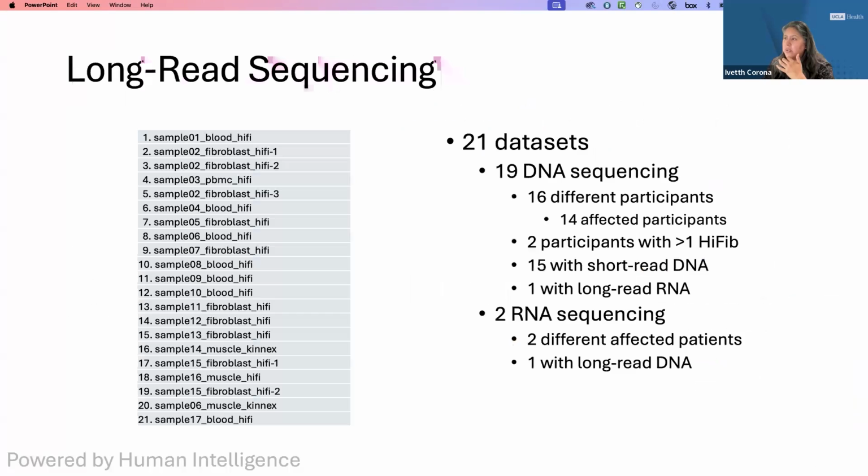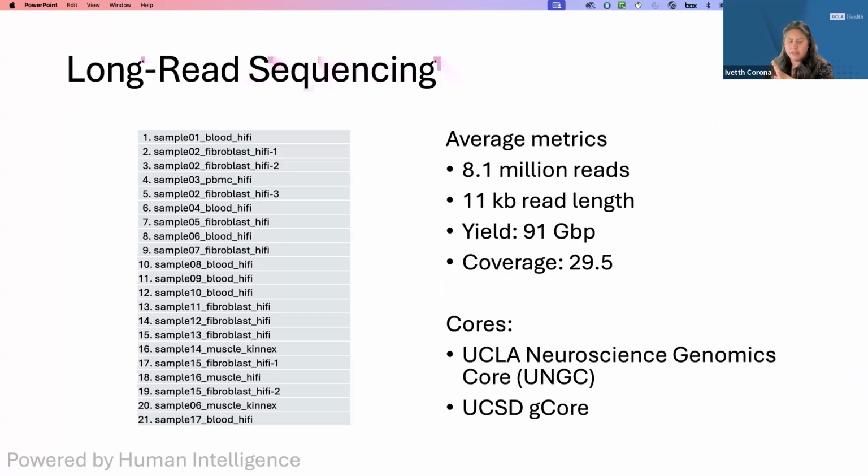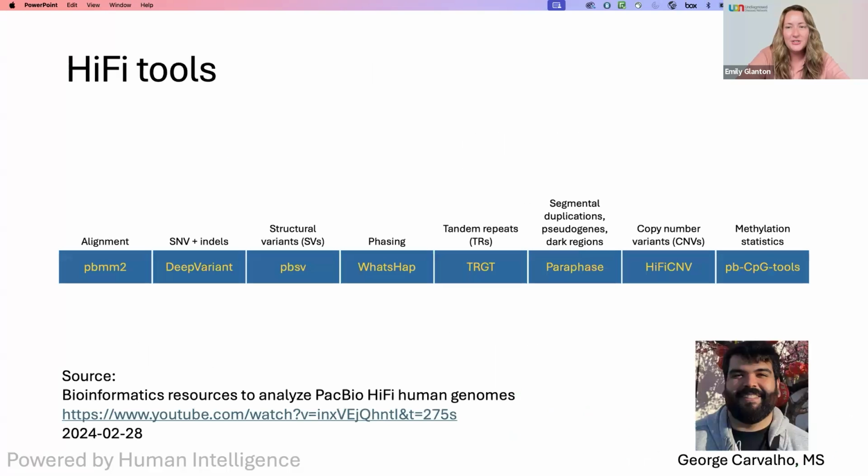Yes, so we have different tools, but the main one is Golden Helix VS Clinical. I think the original one is called VarSeq, but we use the clinical version, and that's what we mainly use.